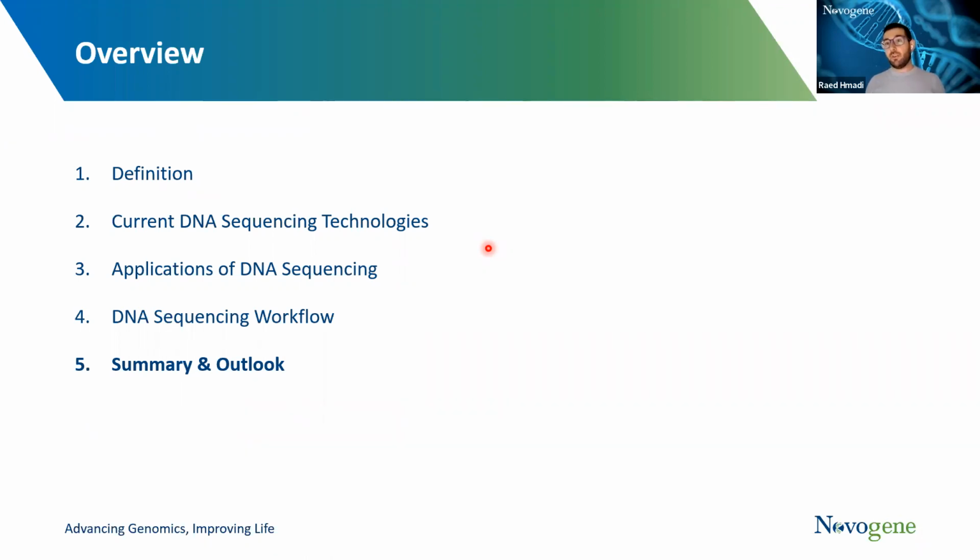And that can affect the way third generation sequencing is performed, because if the DNA is folded in a certain way, that can actually block the nanopore proteins. And then, of course, the sequencing data that we obtain in the end will not be of very good quality. So if they are interested in studying aquatic species, I would really be careful about using Oxford Nanopore for long read generation sequencing.